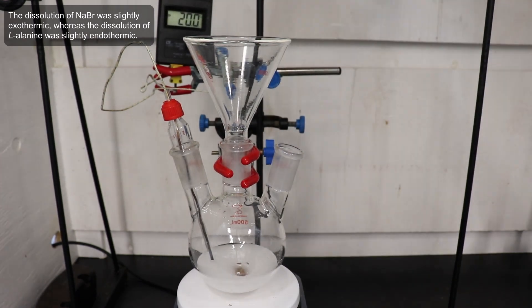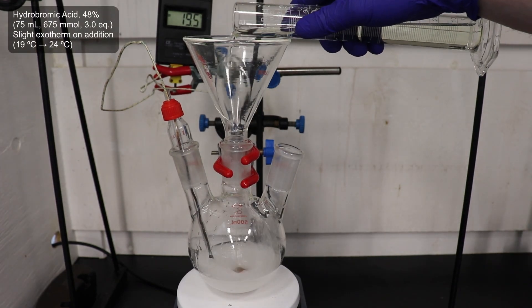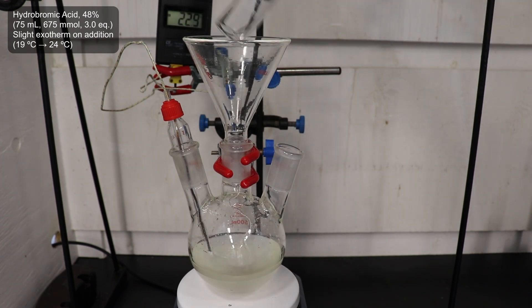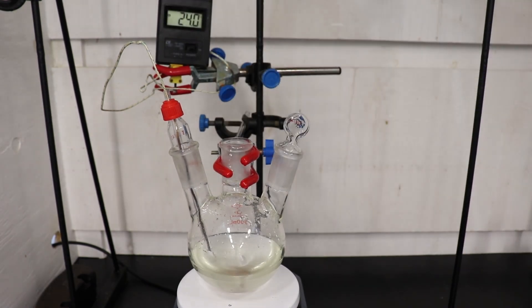Then, I added in 75 mL of azeotropic hydrobromic acid, which I had prepared myself from sodium bromide and sulfuric acid. The addition of the hydrobromic acid caused a slight exotherm, with the temperature rising from 19 to 24 degrees Celsius.